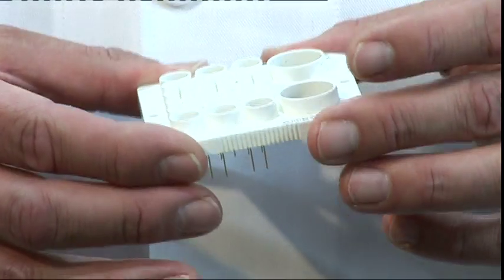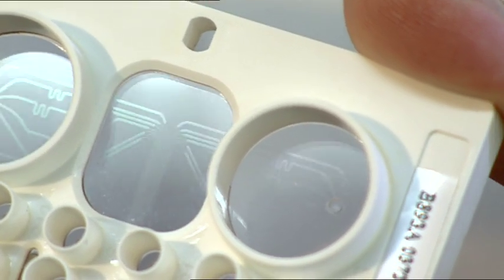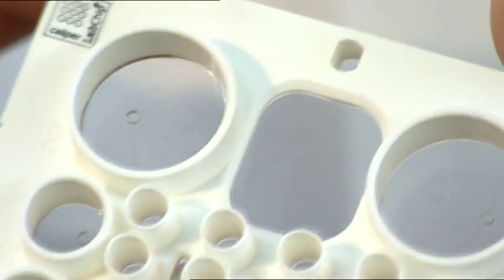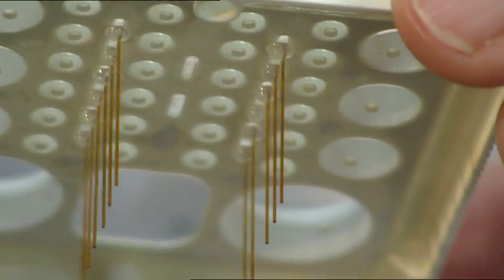This miniature laboratory on a quartz glass chip is similar to an electronic chip, the difference being that, instead of etched electronic lines, it includes a microanalysis system. Samples are pumped over it with an electrical field being fed at the same time, so that these samples can be analyzed on a very large scale. This technology allows us to screen our entire substance collection in only 2 days.